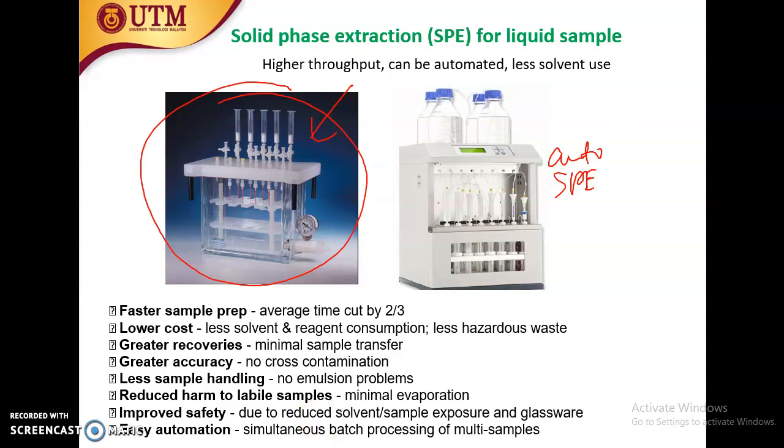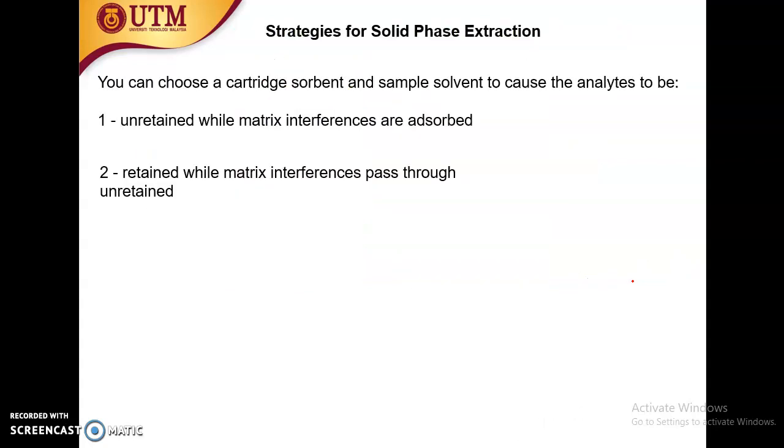Okay, you can read here on what the advantages are between SPE and liquid extraction. The greatest difference between the two of them is that SPE uses less solvent. Okay, this is if we are comparing conventional liquid extraction and conventional solid phase extraction.